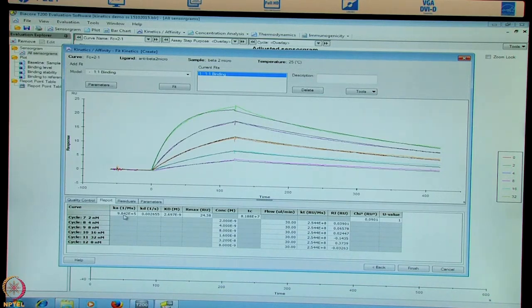Now we go to the next tab, report. You can see a lot of information that is generated here. The on rate is given here. Similarly, there is an off rate and there is an affinity or a binding constant provided here. The Rmax is also given. The various concentrations that were used to set up the experiment are provided here. Flow rate for this experiment is provided here. The change in the refractive index due to differences in the sample and running buffer are provided here. And quality control parameters like chi-square and U value are also shown.